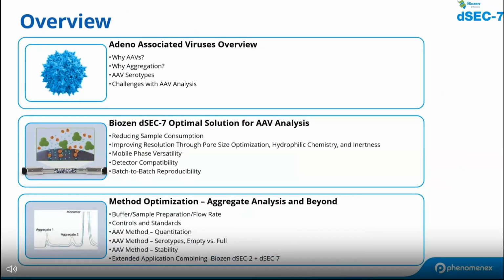Here is a brief overview of today's presentation. We will focus on adeno-associated viruses. What are adeno-associated viruses? Why aggregation analysis? And then what are different AAV serotypes? We'll also talk about common challenges associated with AAV analysis.